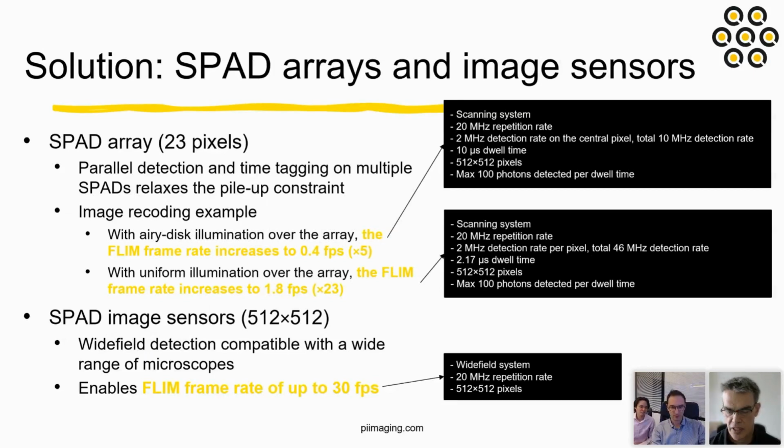So I'm just going to add to that, it is true that you only capture a single photon in a single time point, right? It is, as you stated, digital. You find a photon, or you don't, and within that very, very short exposure time down to 6 nanoseconds, you're only going to detect 1 photon. For 1 pixel, correct, yes.